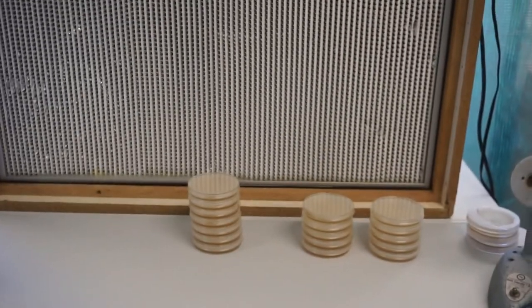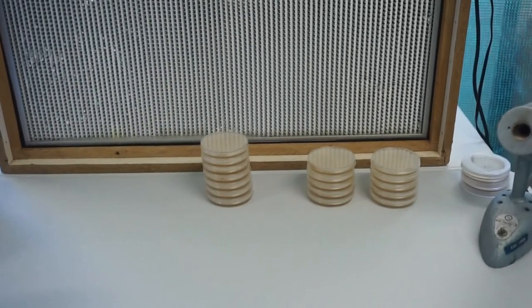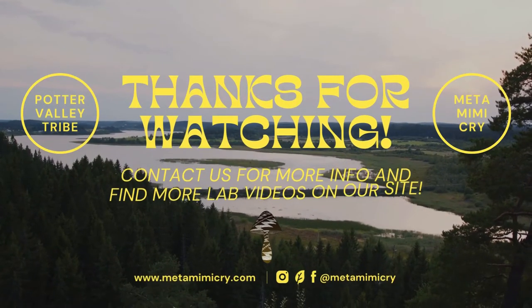Leave the flow hood on and allow plates to cool for up to an hour before using or wrapping with parafilm for storage. Now that's that. Now you're ready for culture.